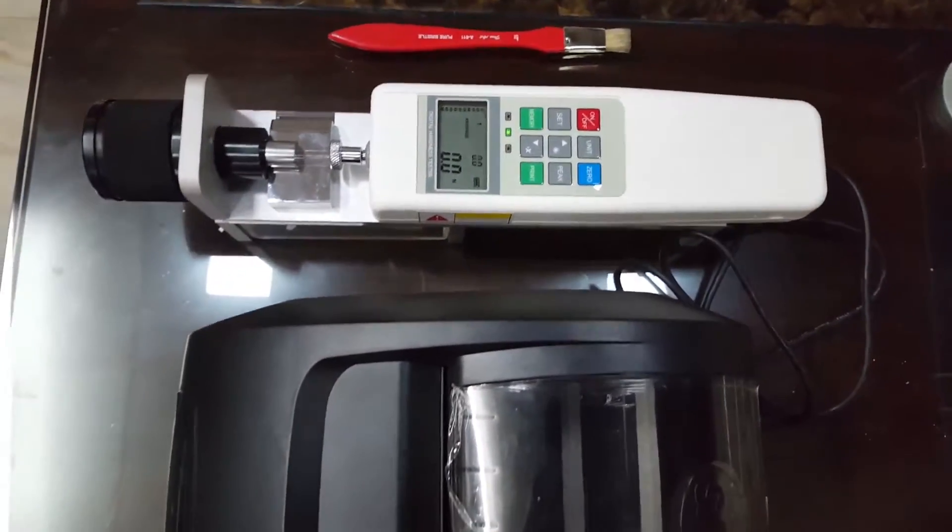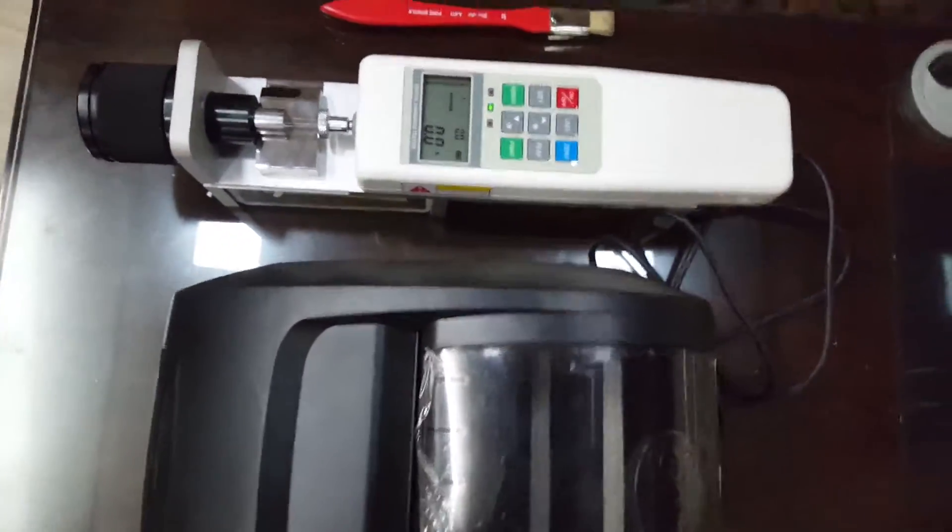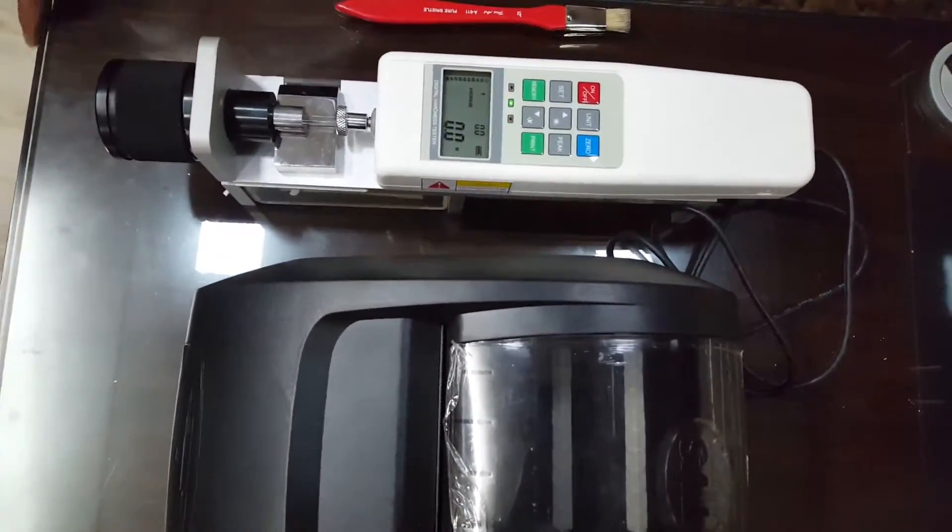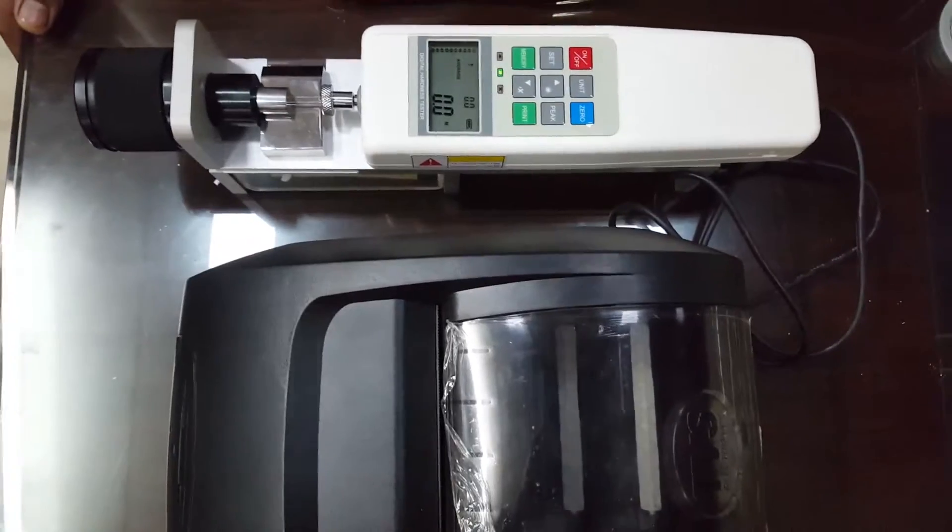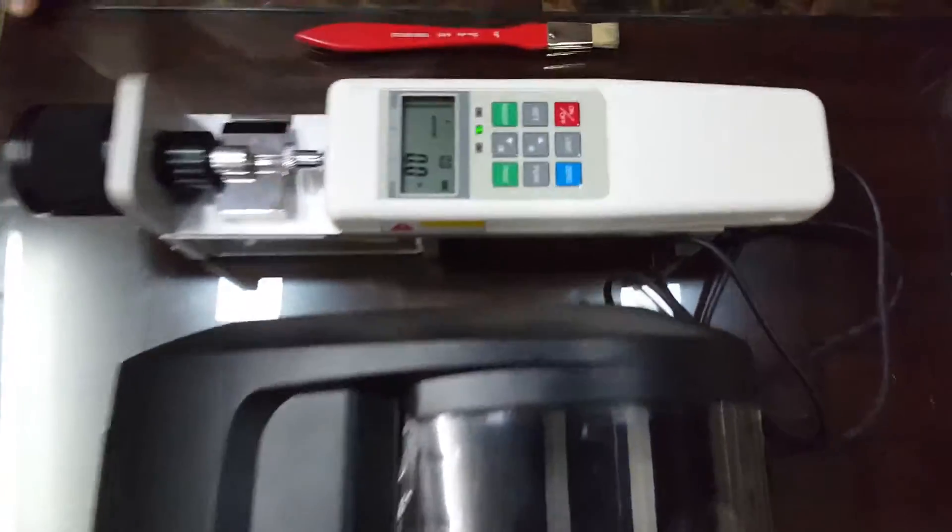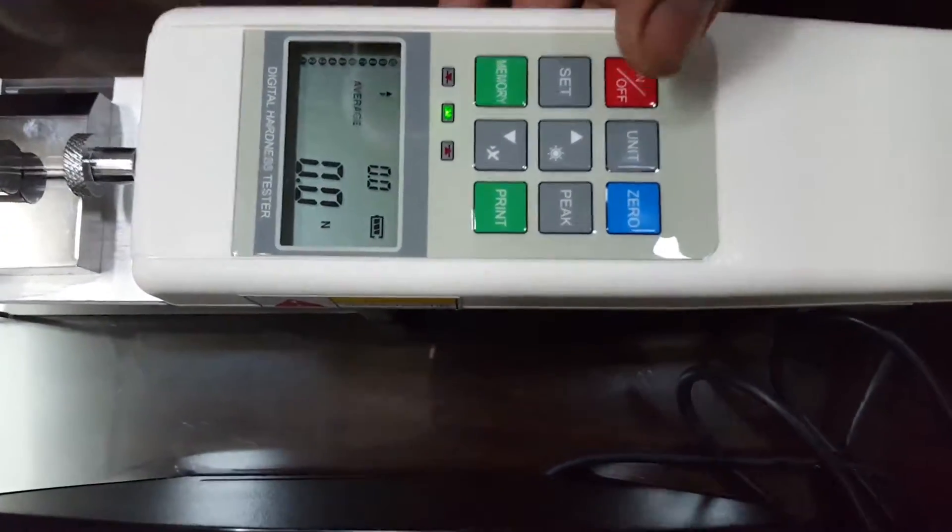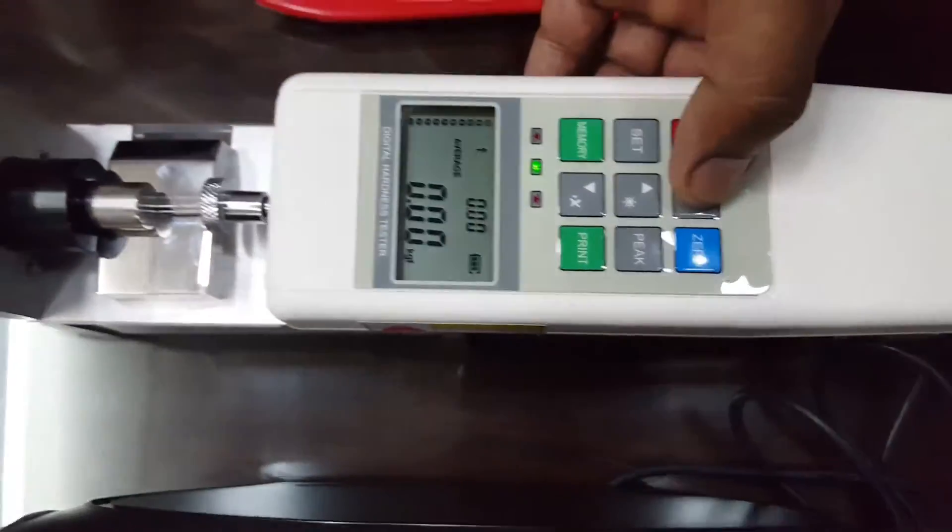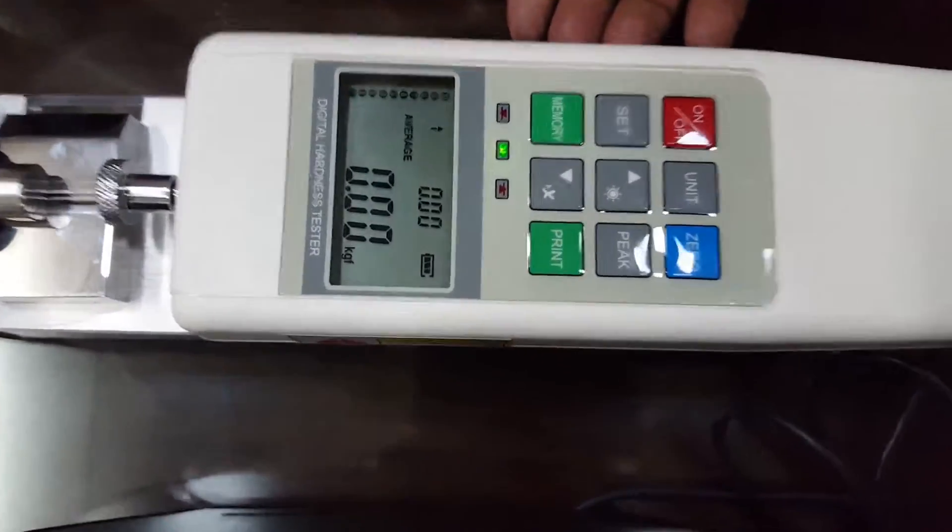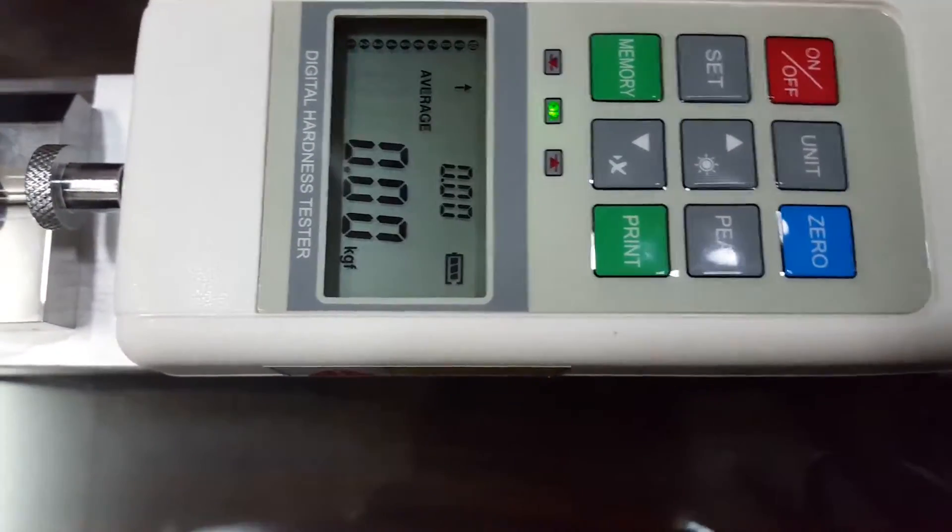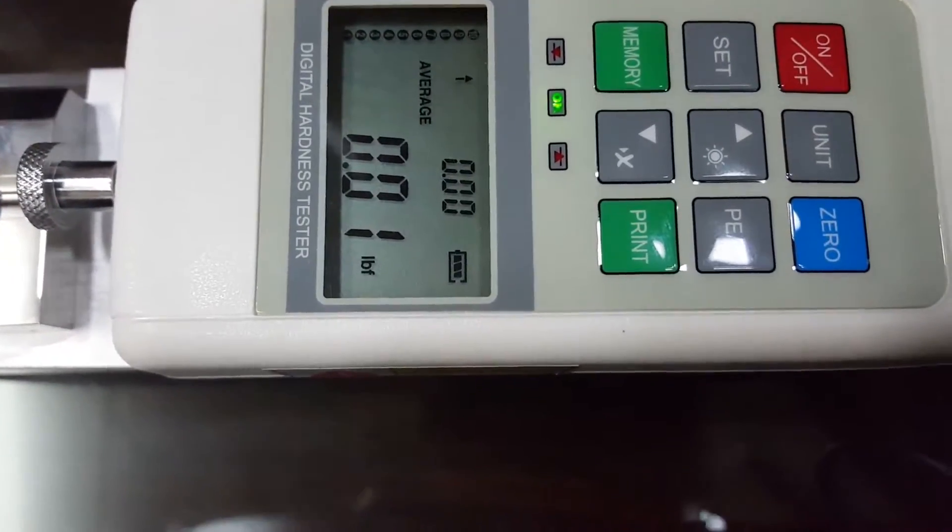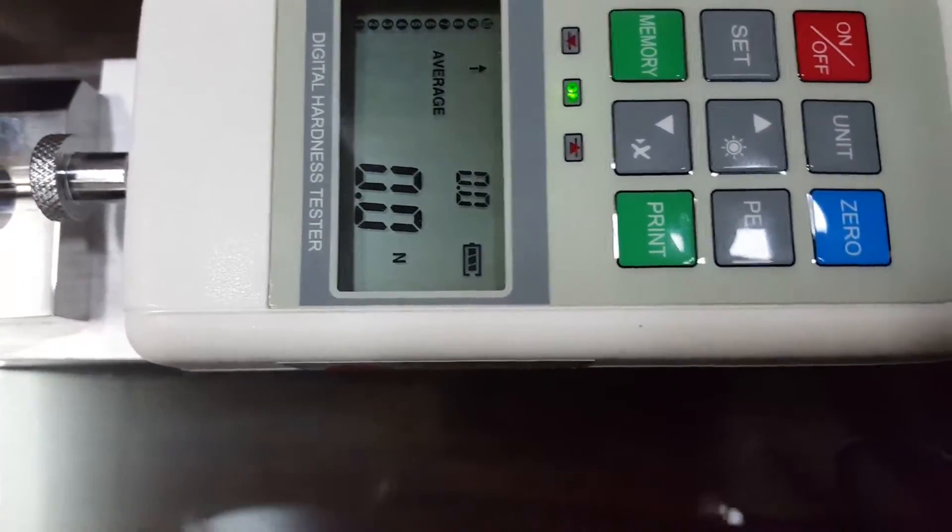The range of this equipment is from 0 to 50 kg and we can select the units from the unit button. We can measure in kg force, pond force, or newton, any of the units as per our requirement.